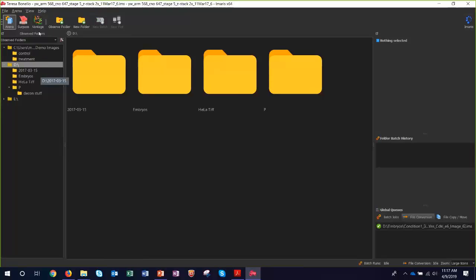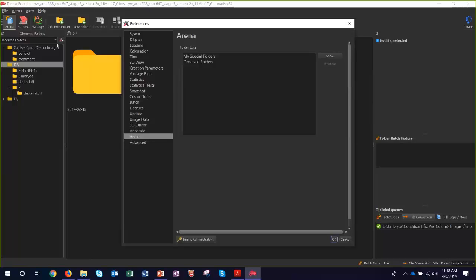So what I'm going to do in that case is I'm going to switch over, and I'm going to show you that you can have a whole other list here, and then I'll show you how I would add in new folders with a new list. So we decided that it was important to have multiple lists, and so you can see this drop-down selection that I have right here. I just clicked on this button to bring up this new window.